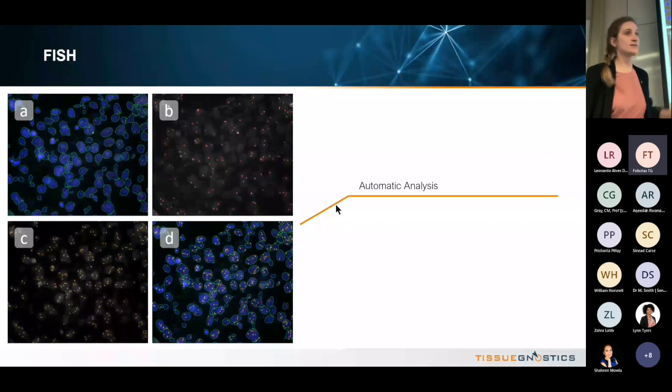And then in the end, you can see the combined mask. And then you can export the number of dots per cell. You can also export the total number of dots, so whatever you want to. And this algorithm is super easy to use.